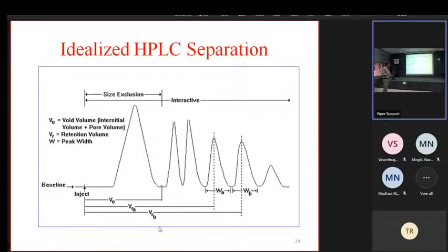qualitatively, it is the retention time. The time required to elute the compound from the column is called the retention time. The area under the curve is directly proportional to the concentration, the quantity of the component contained in the given sample. So here these are the two components eluted, and we get the spectra. Then the interpretation of the spectra will give the assay of the sample.